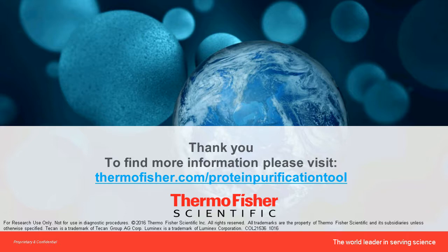Excellent, thanks, Andreas. And our next question asks, why do you think the Western blot and ELISA results for many targets disagree compared with the Luminex and Multiplex IP targeted MS assays? Is that something you can answer, Bhavin? Yes. So we know that we use different antibodies for this target for different technologies. So the antibody that was used for Western blot and ELISA is not the same antibody that we use for Luminex and IP to mass spec assays.